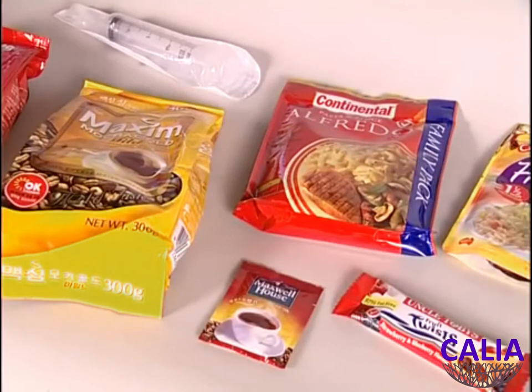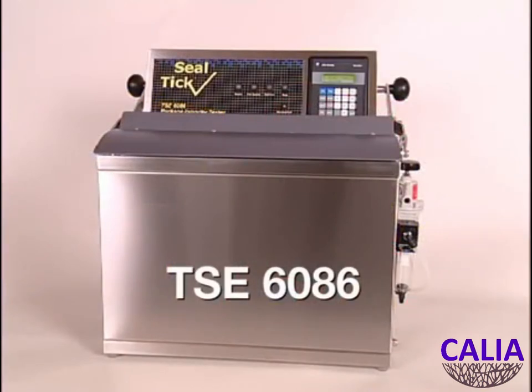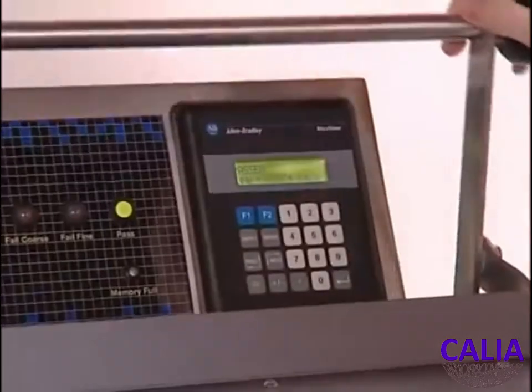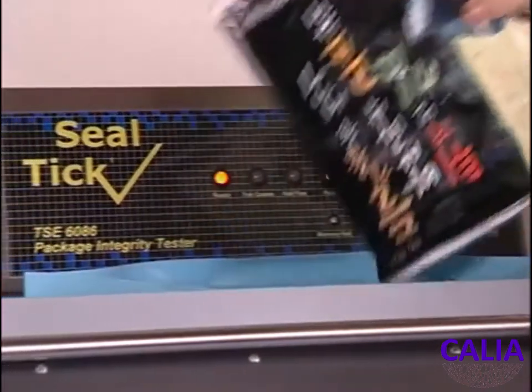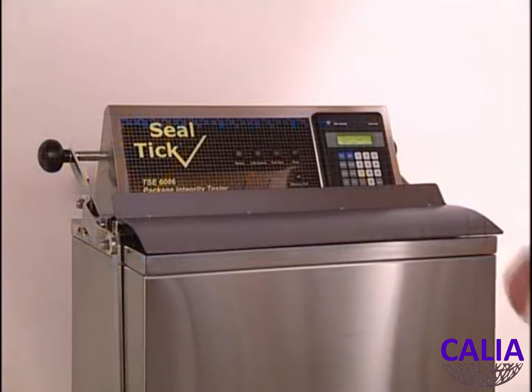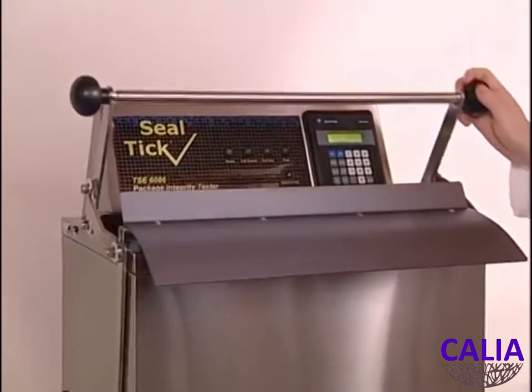Designed to cope with a wide range of package shapes, sizes and flexibility, the TSE 6086 focuses on simplicity and speed of use. It is quick, dry and objective, and packs are not damaged, so they can be put straight back on the packing line. The stainless steel construction makes it ideal for use in a production environment.